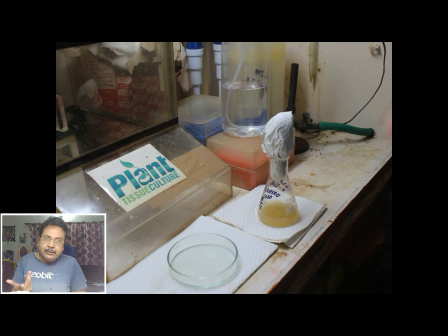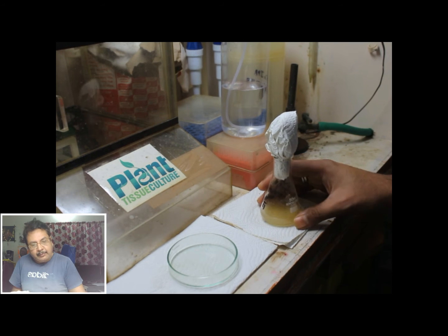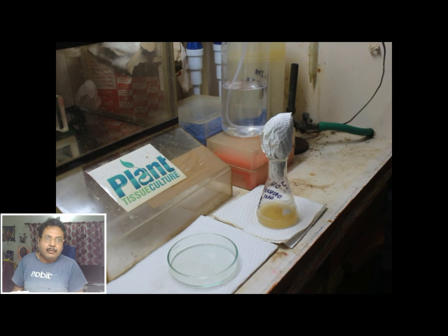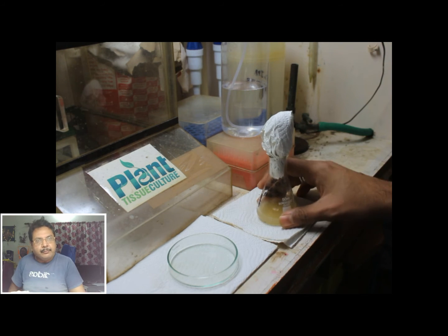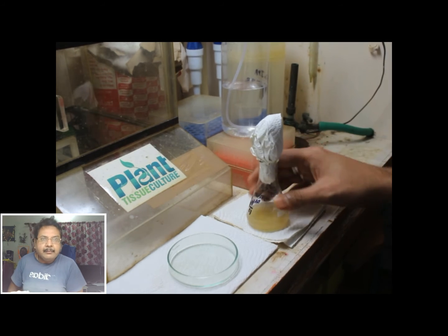So as you can see, we can presume very easily there is a microbiological change. What change? This change can be said from this culture media view, just a naked eye view of this pH change. We can say that acid producing bacteria have accumulated in the medium. And maybe some fungi are there, lots of debris are there in the bottom of the tube, as you can see. These debris are actually gathered, and therefore maybe fungi are there.